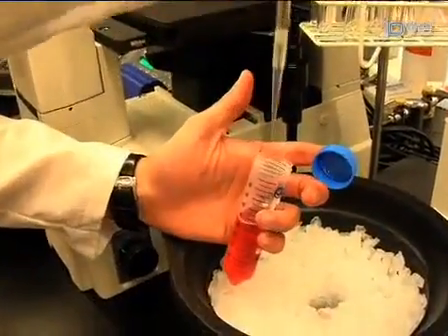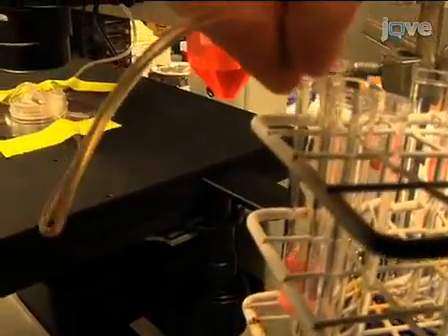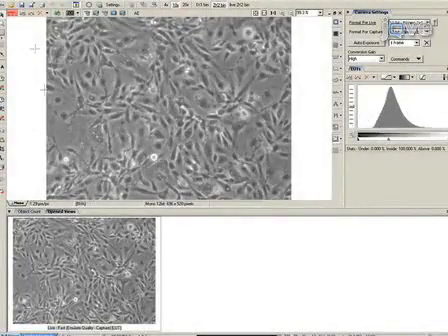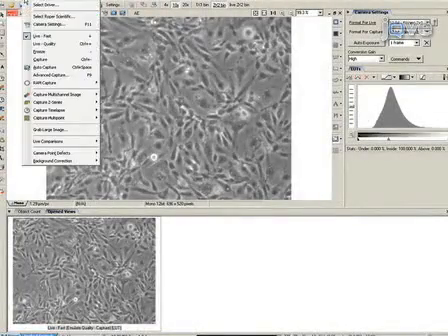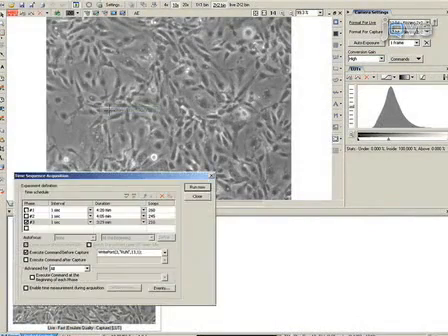Pipette 1 ml of KG1A cell suspension into the 5 ml test tube near the input tubing line. Then place the input line to the bottom of the test tube. Go to the menu bar and click on Capture and Time-Lapse Acquisition. Select the protocol lasting 210 seconds. This is the length of the program for rolling on HbMEC60 cells.